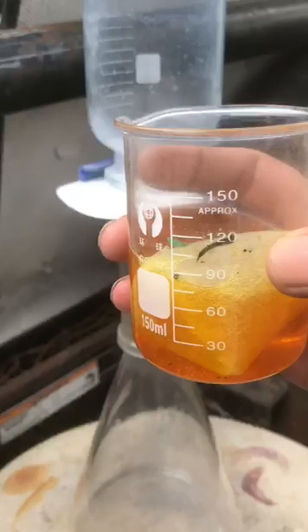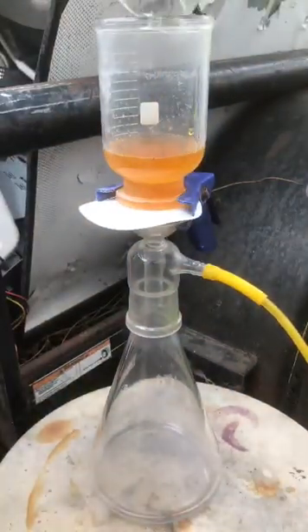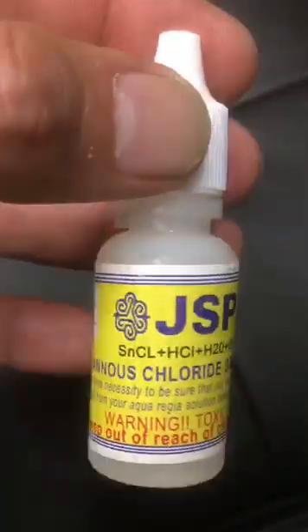Now I will filter out the aqua regia with the filter vacuum pump — nice and clean. Now I will do a stannous chloride test; this will turn dark purple if there is gold in the solution.